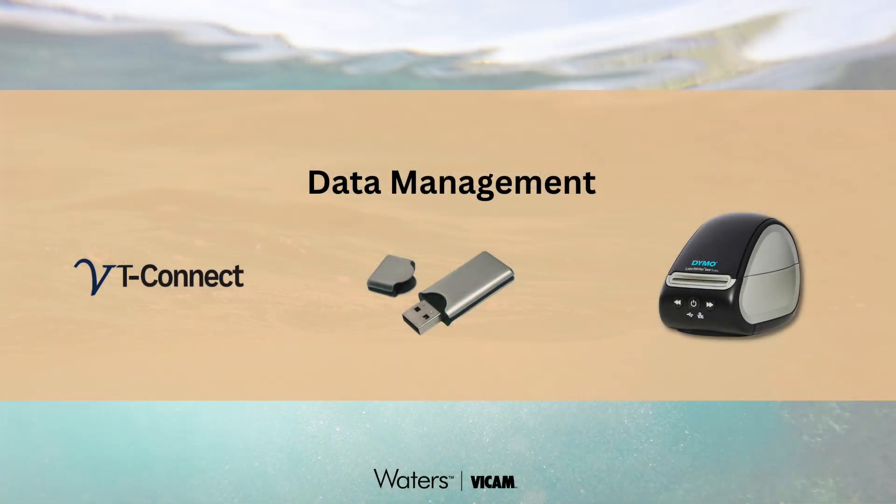Your results are now ready for use or transfer using onboard storage, USB memory storage, or VirtuConnect software, which enables secure data access and sharing within your operation. Thank you for spending time with us learning about glyphosate V for glyphosate monitoring in cereal grains. To learn more, contact us today.